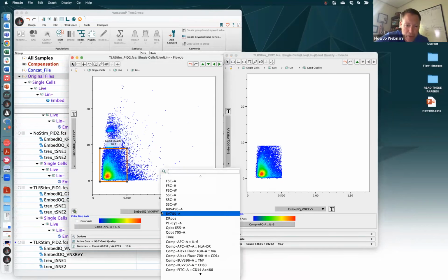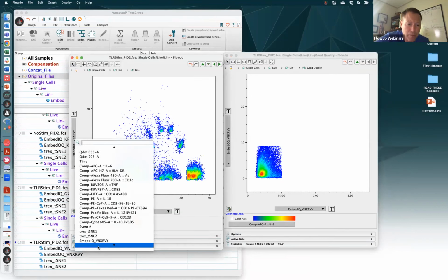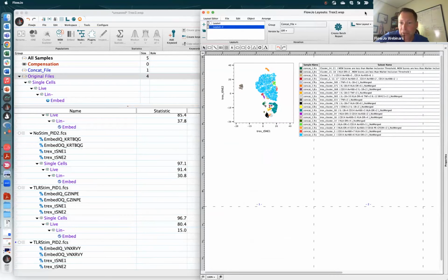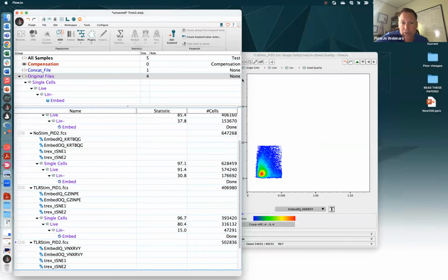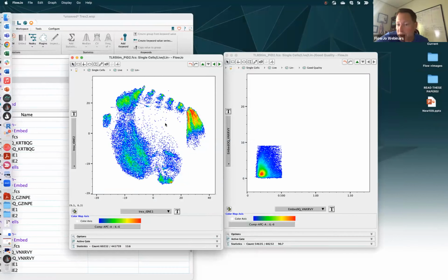So we can look at this and go to our embed t-SNE scores, t-SNE 1, t-SNE 2. Okay. And so I've picked a stimulated population. If you remember from our examination here, the unstim population was this, this big guy right there. The more stimulated ones were down here, and there's a mix of things in there. So that is reassuring to look at that plot, which is now behind this one, and say, okay, so the population that's missing in this stimulated file is the one that disappears during stimulation. So cool, that makes sense. And we've got a little bit of everything else.